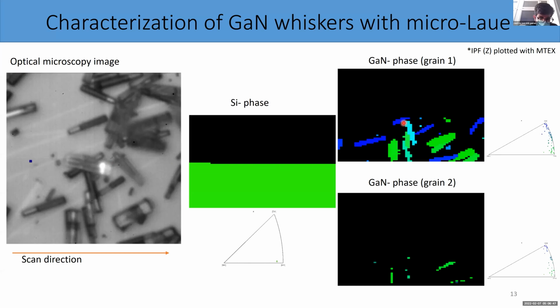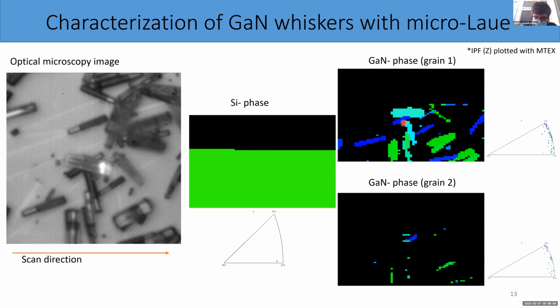And of course, the speed here is exaggerated. It is going much faster, but in reality, one measurement of a Laue pattern can take around a second to measure and then save the data. And then similarly, the indexation should be in real time. So we should resolve the Laue pattern as soon as the data is being generated.